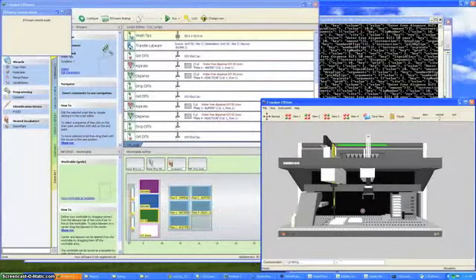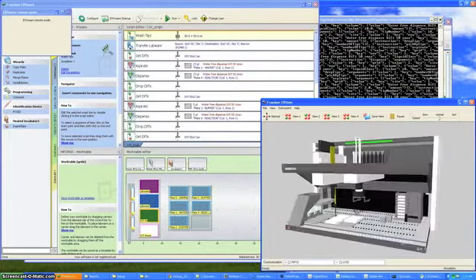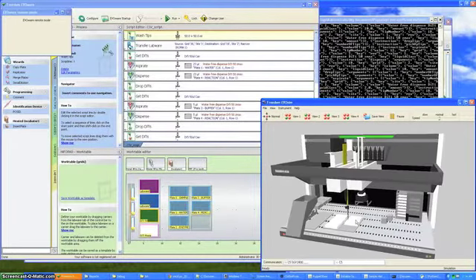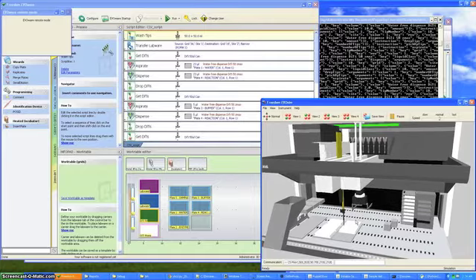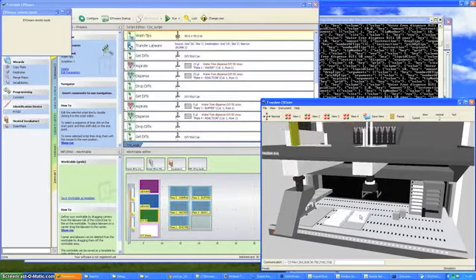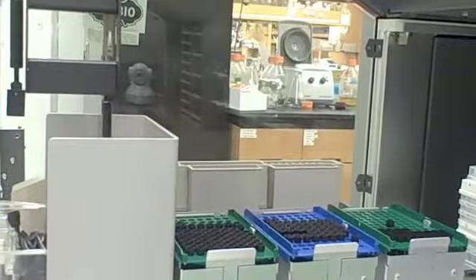The final protocol is first run on a simulator for verification, then it is run on the actual robot with real samples.